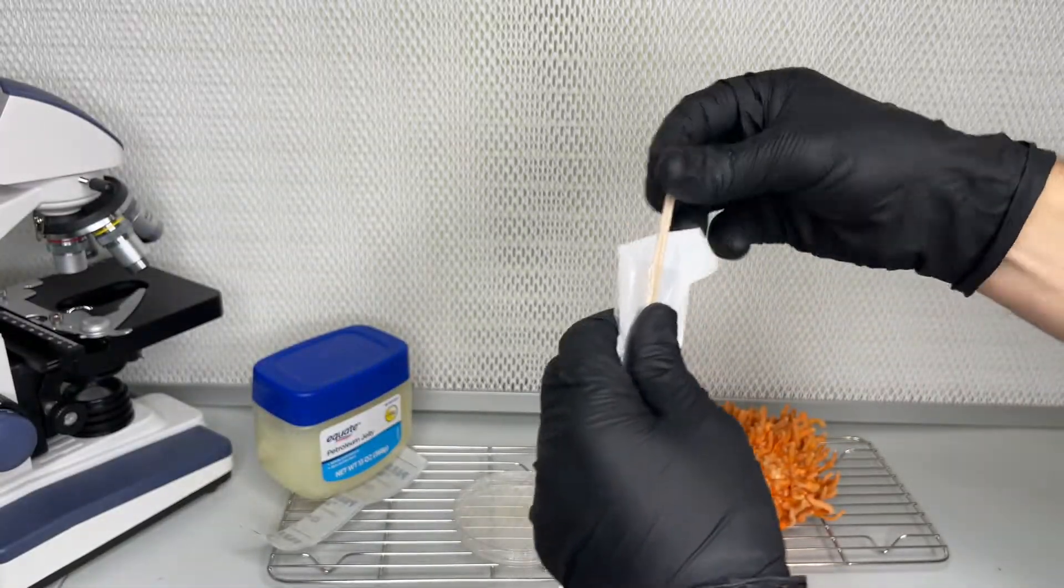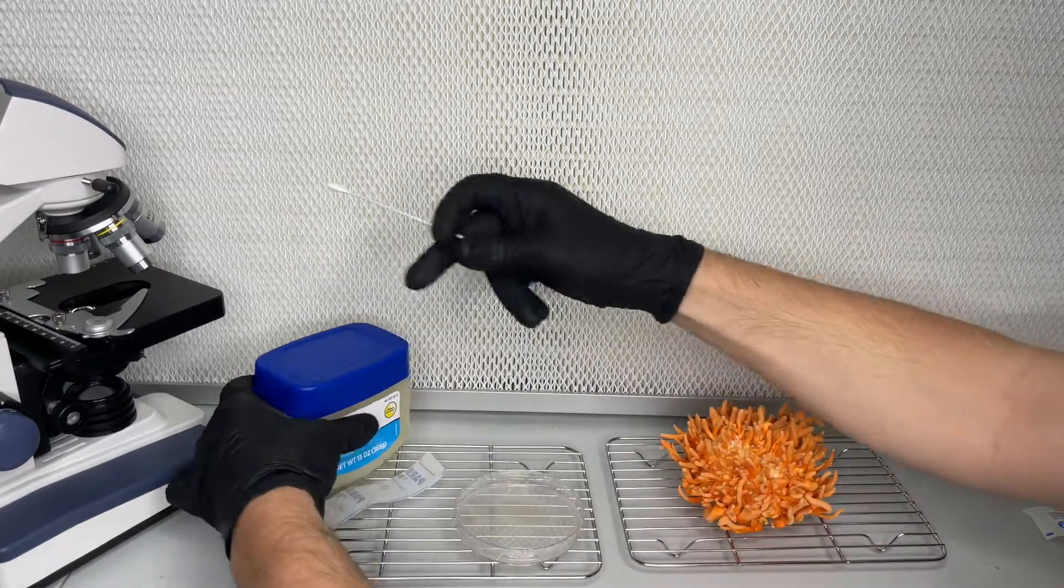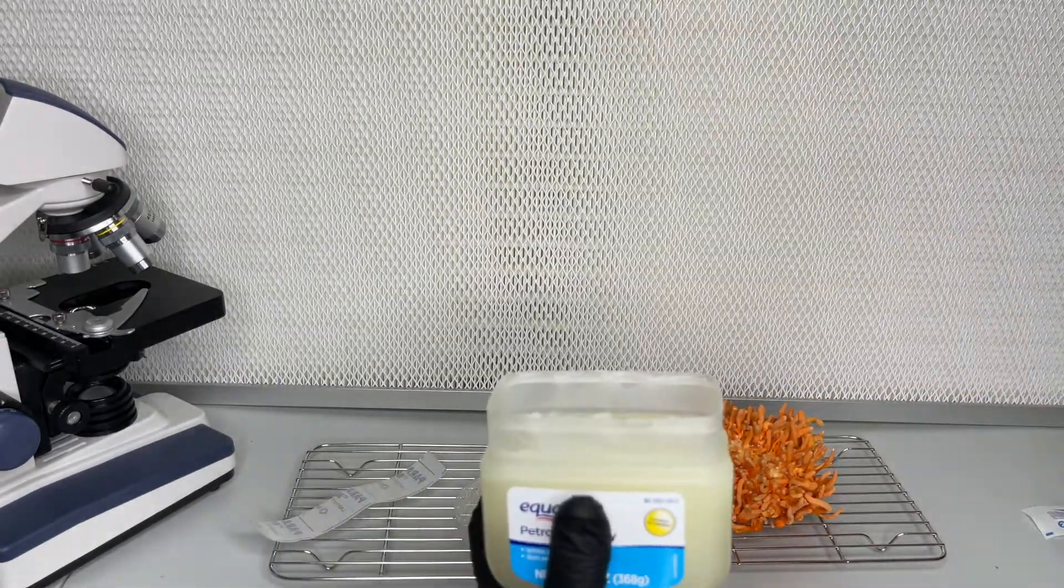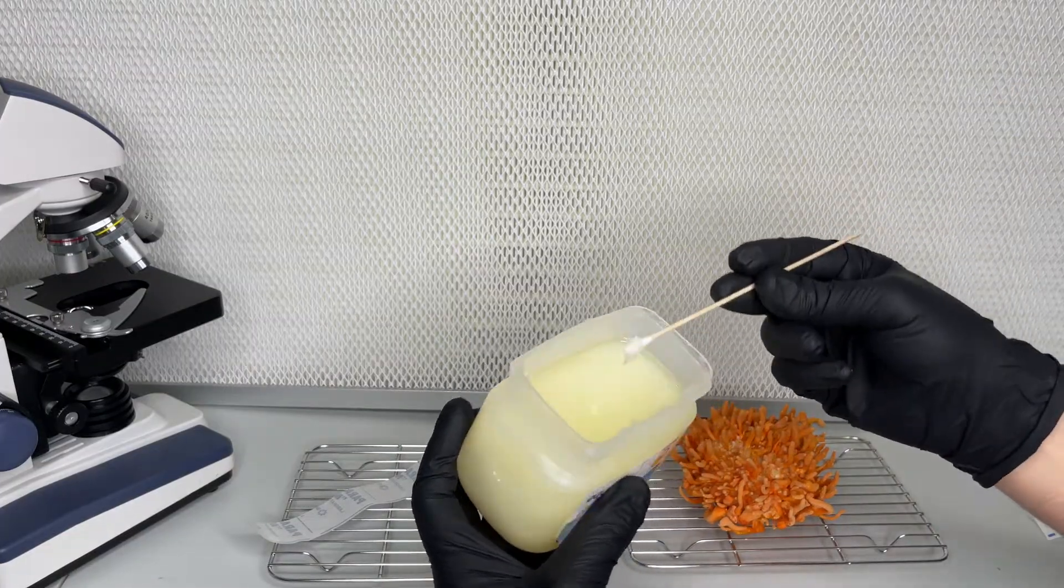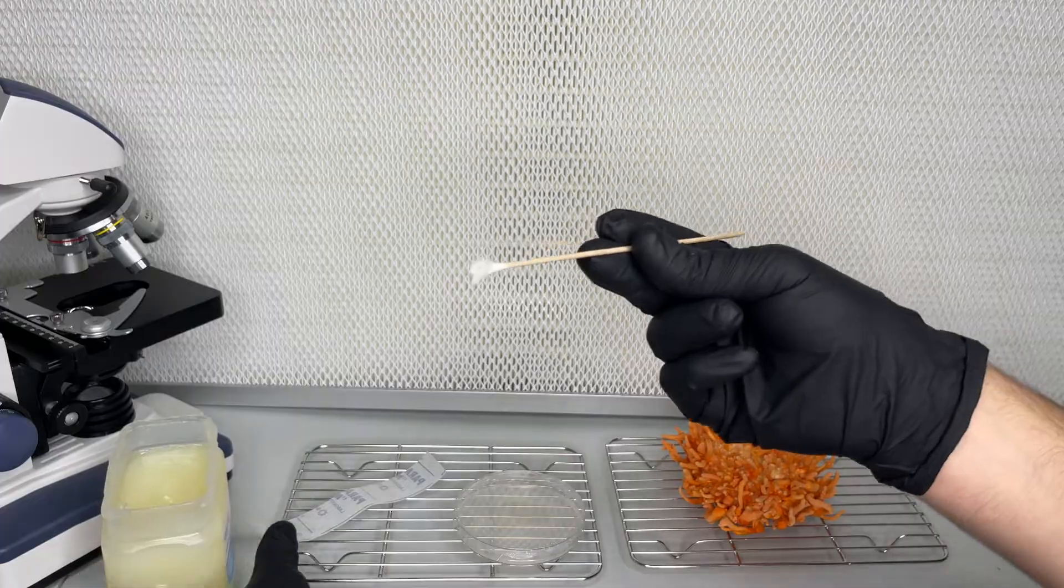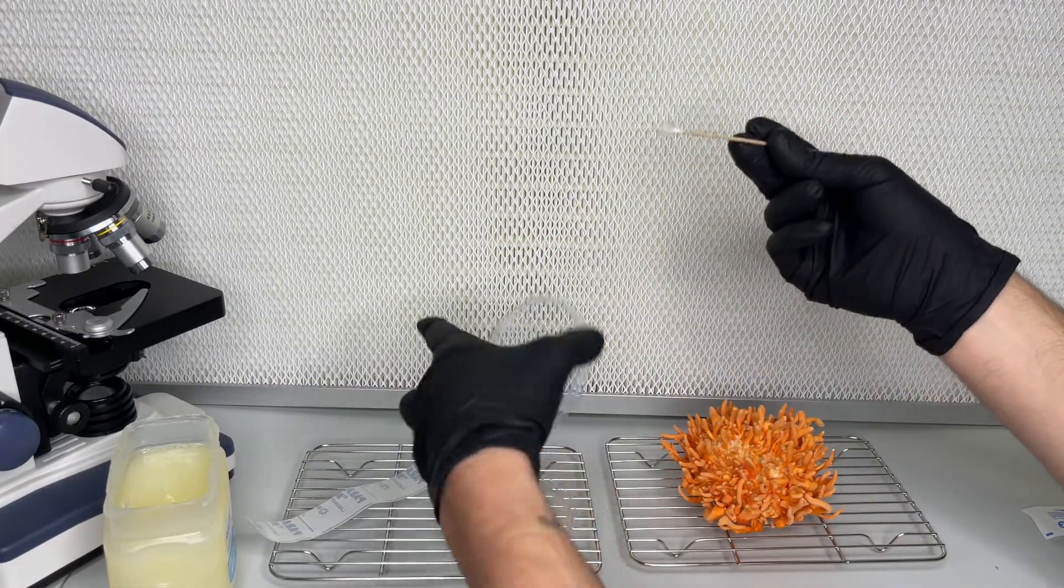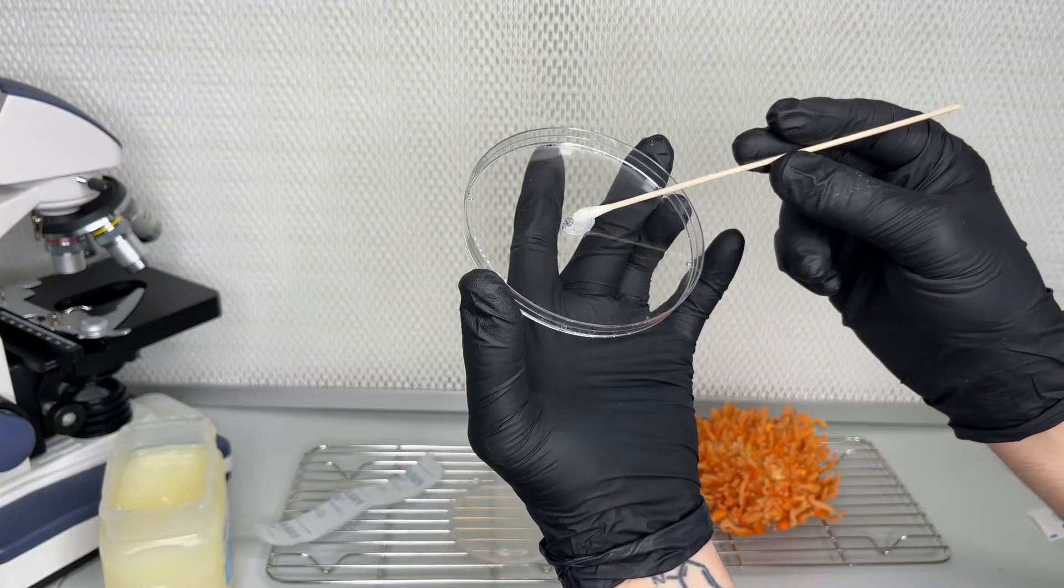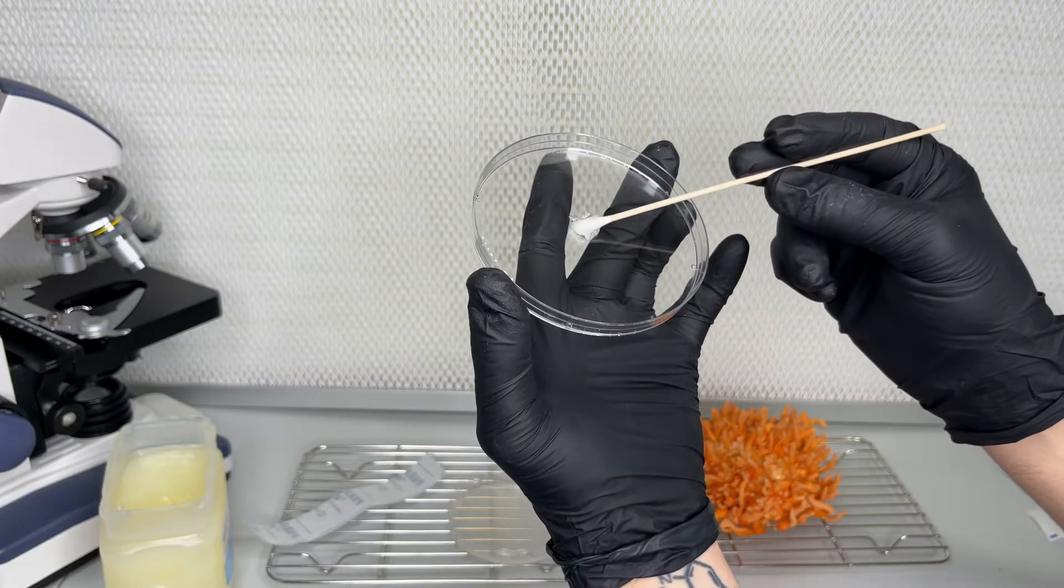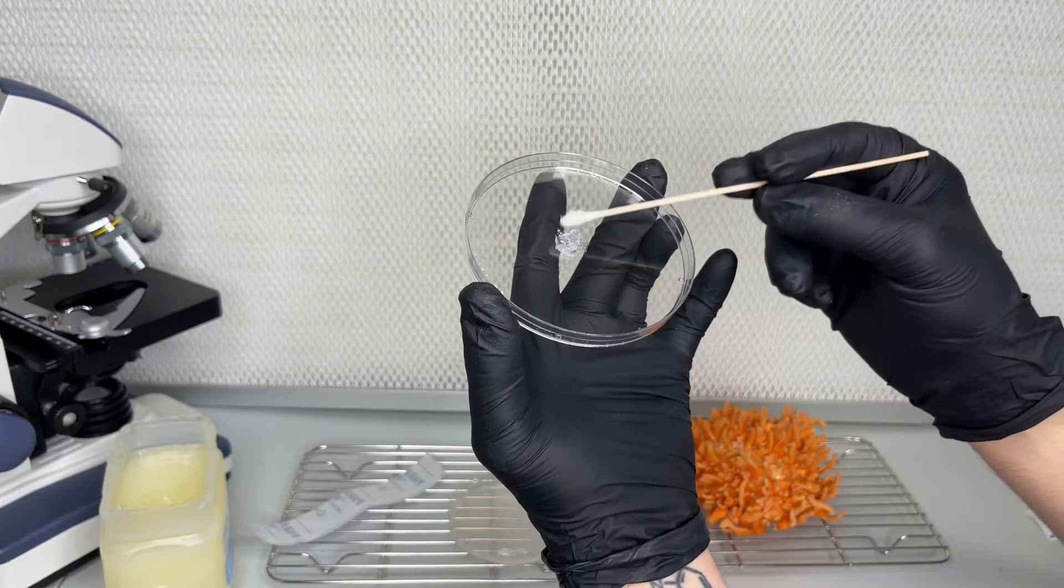I harvest one of the Cordyceps and stick it to the top of a sterilized water agar plate using Vaseline and a cotton swab. The ascospores will discharge onto the water agar plate below within a few days, germinating into monokaryotic mycelium. The monokaryotic mycelium from nearby ascospores fuse together forming dikaryotic mycelium, which is capable of fruiting.